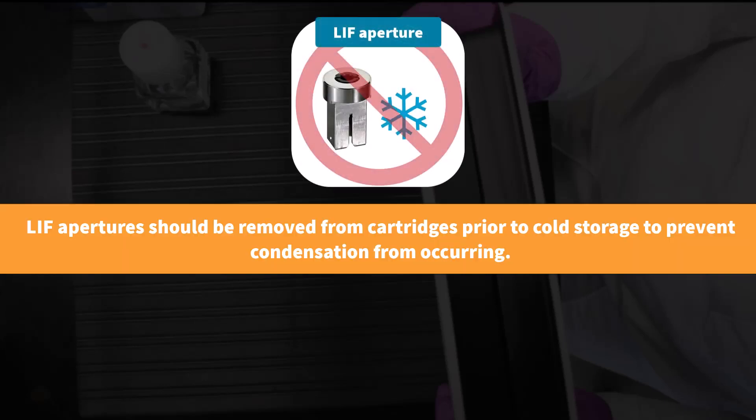Some may be stored at room temperature, while others require storage at temperatures between 2 and 8 degrees Celsius.